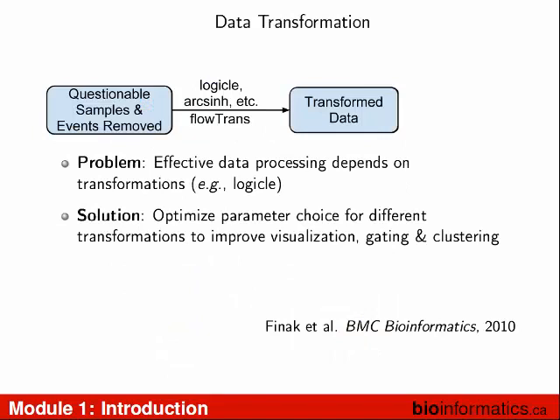So we have data transformations, and we got them all. I want to show a couple here. Transformations is another pain point for us. And absolutely, as you probably know, how you transform your data has a huge impact on everything else you do after. If you don't get your parameterization right on how you do the transformation, everything else is going to fail. So we spend a lot of time, like you probably spend a lot of time, trying to get those transformations right. There are some tools that will help you do that transformation.